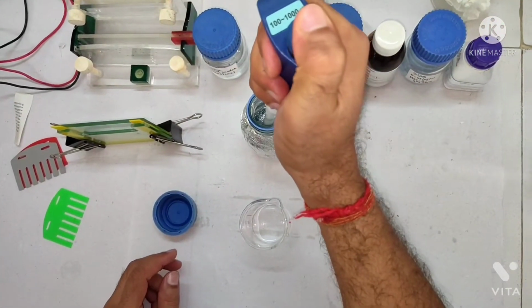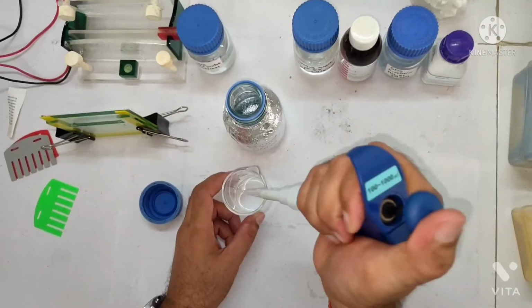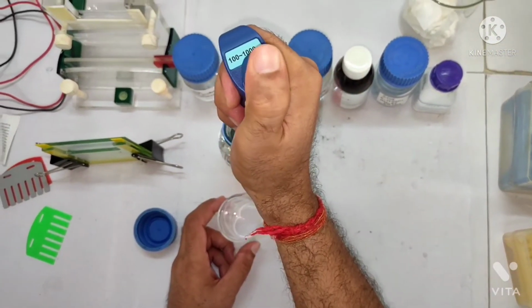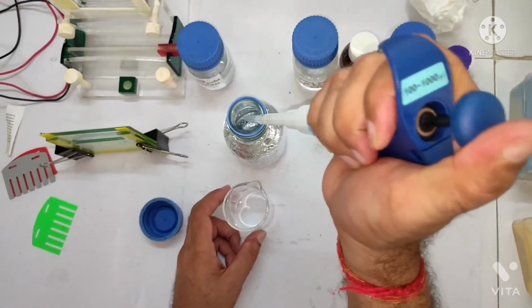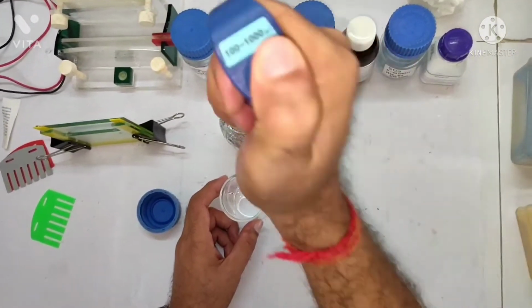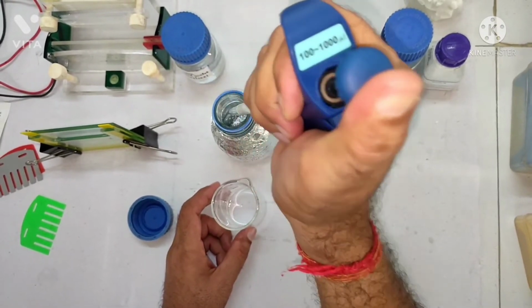So first I am taking 3 ml. Now the acrylamide and bis-acrylamide solution is neurotoxic, so take care of that. You should wear gloves, and if gloves are not there, then at least you should wear a mask. Don't do mouth pipetting, right? So these are the cares that should be taken.